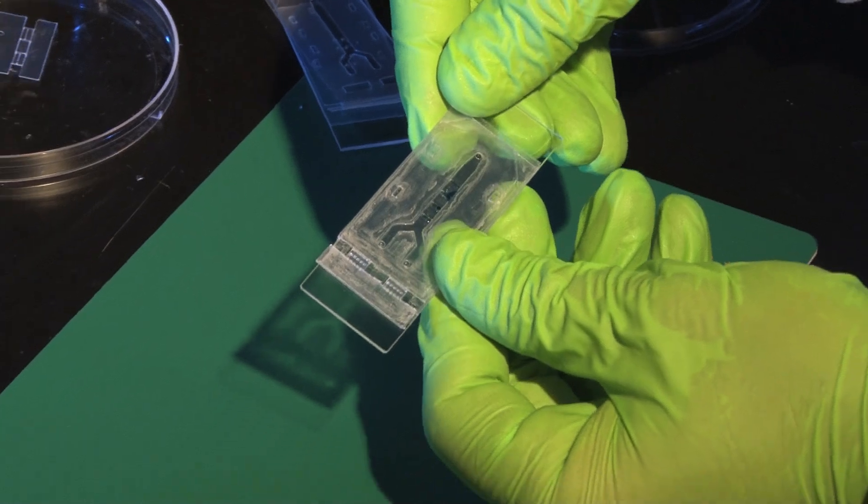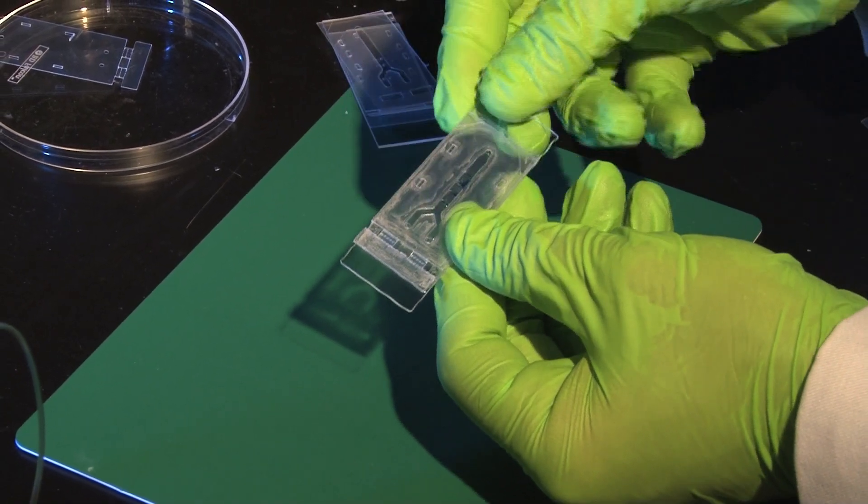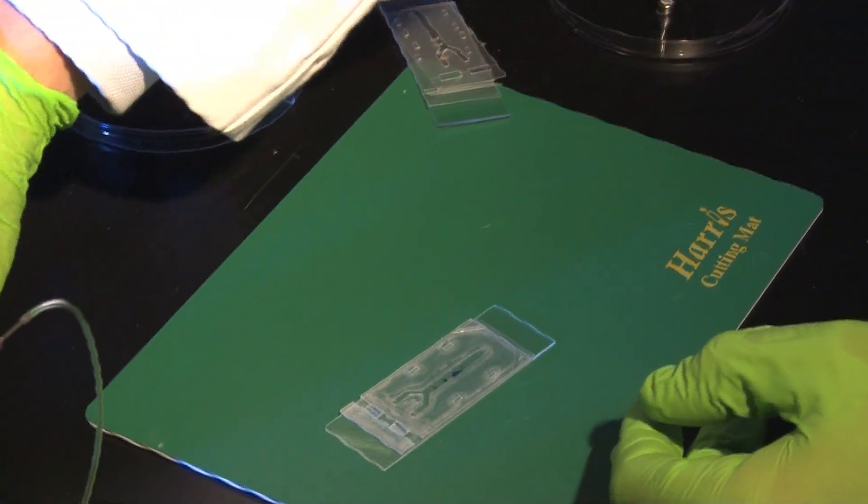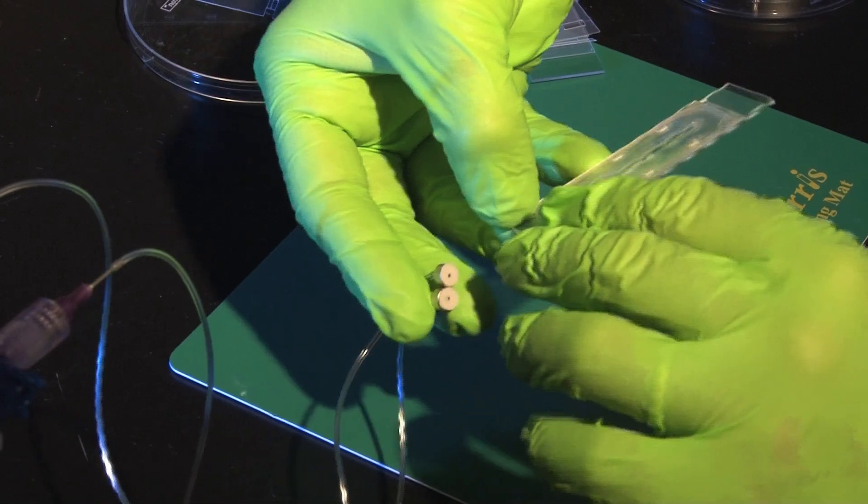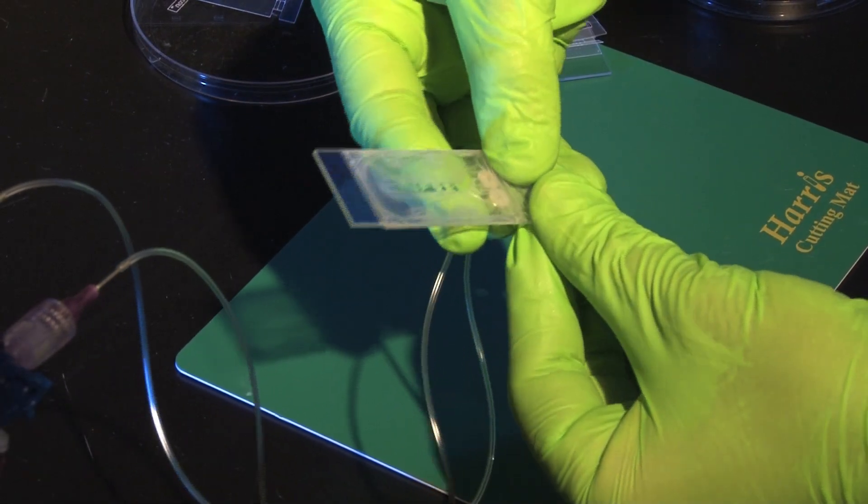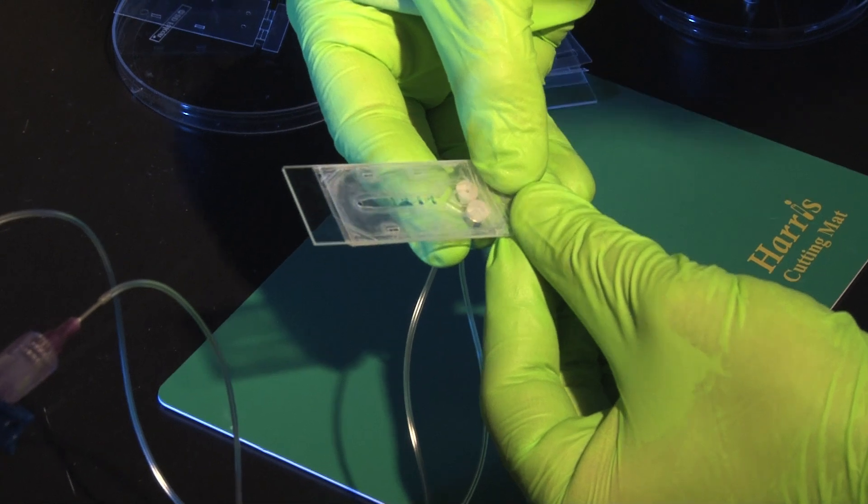So the chip is closed now but in the upper channel we've got these holes but there's no liquid. At this point what I do is that I use magnetic connectors which are magnets with holes. I place them aligned with the entry holes of the chip.